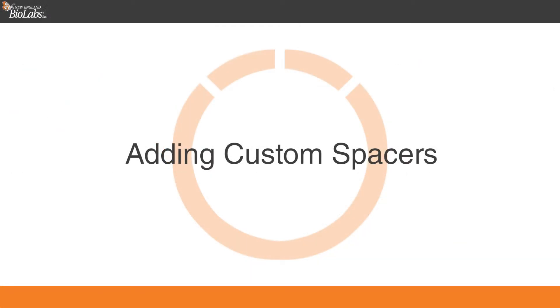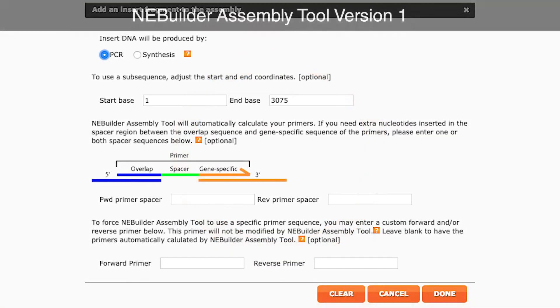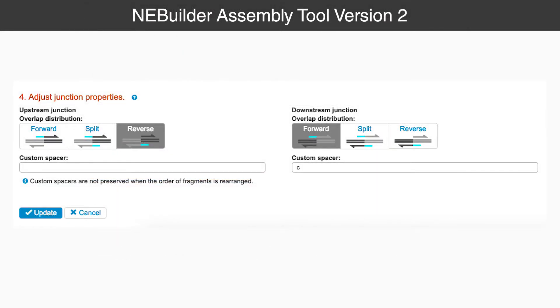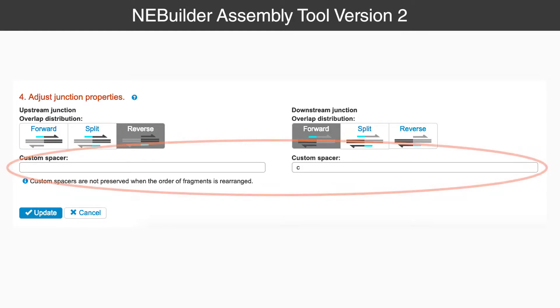Adding custom spacers. AnyBuilder version 2 changes the point at which custom spacers between fragments can be added. In version 1, spacers could be entered during the initial fragment entry or by editing an insert fragment by double-clicking on it. In version 2, spacers can only be added after fragments are entered by editing them, clicking on the pencil icon, and scrolling down to the junction properties section.